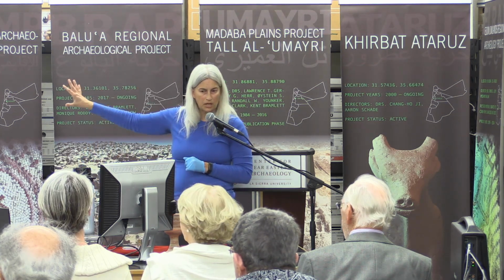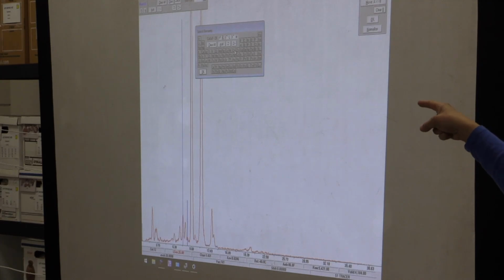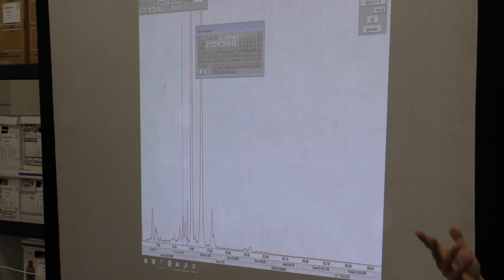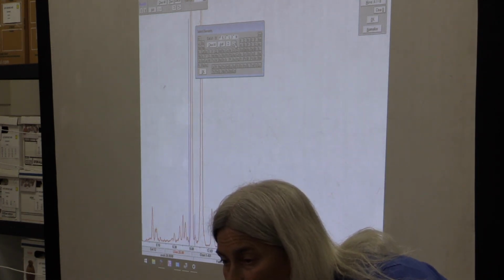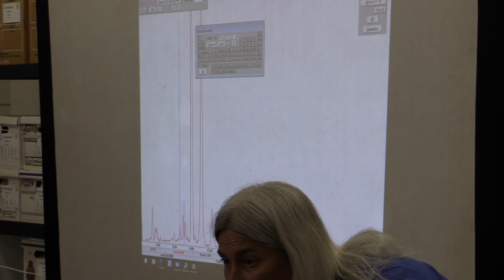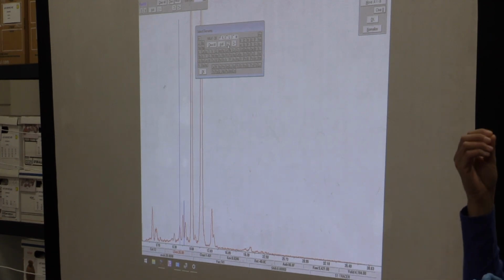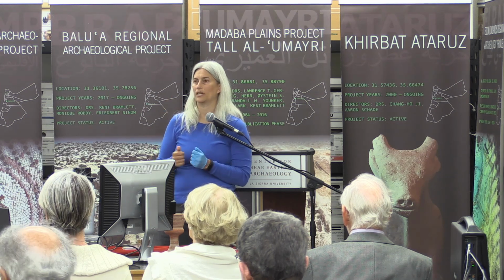So now I switch back to copper, and even though these are gold, they do have a little bit of copper in it. Just like all of our jewelry that we have today, they put something else in there to keep it from being so squishy and just losing its shape entirely. So one of those elements that they put in there is copper. And it looks like a little bit of nickel. I haven't run this one before, so that's my guess. So copper and nickel go into those, and they have very fine detail, and that's one of the reasons they were able to get that fine detail. It's that they didn't just have gold, they had these other elements.